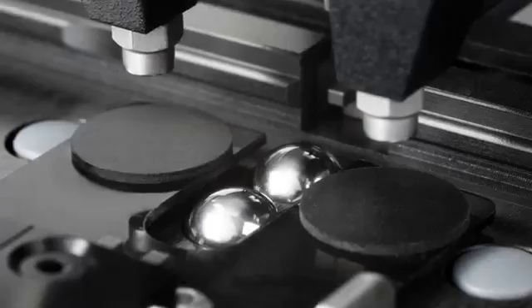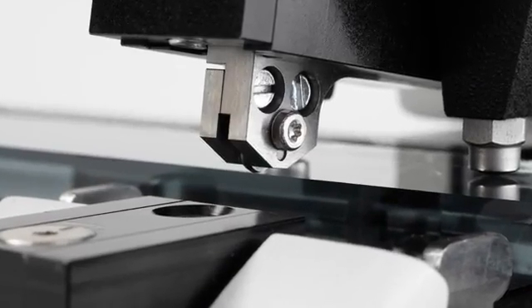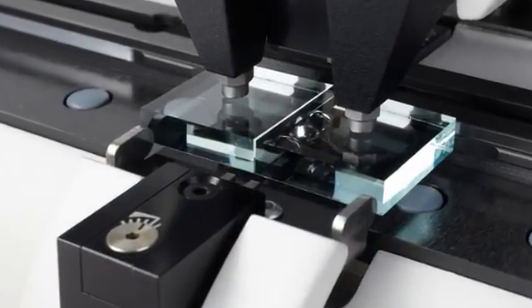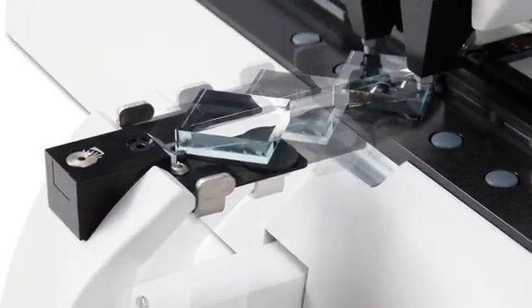The sharp cutting edge of a glass knife is a prerequisite for semi-thin and ultra-thin sectioning. With the new Leica EMKMR3, perfect knives can be produced from 6–10mm thick glass with minimal skill and effort.